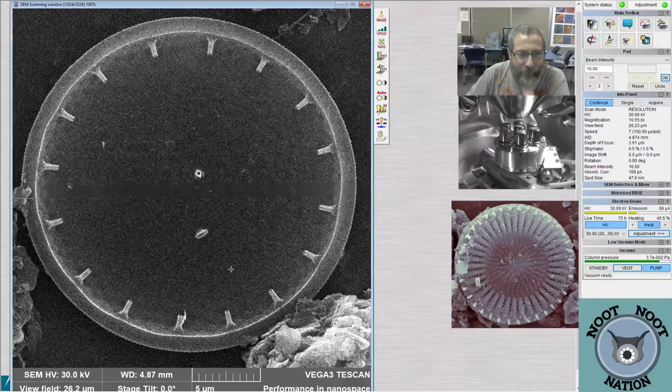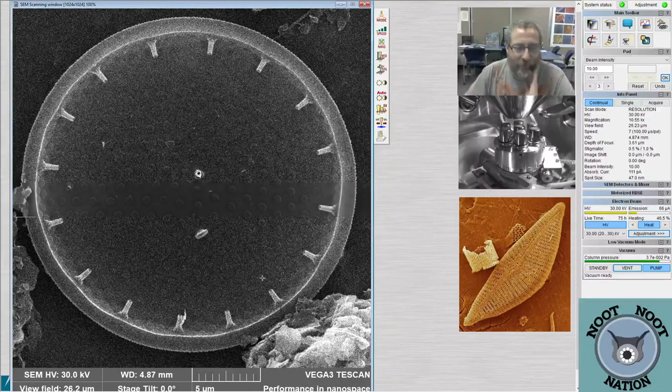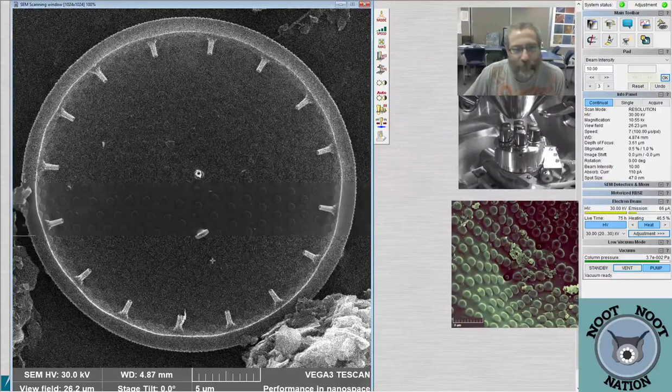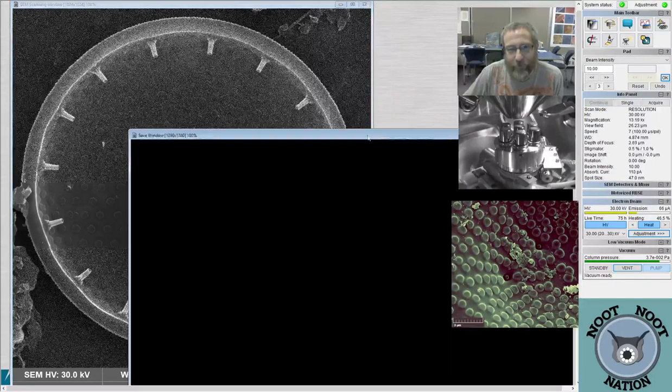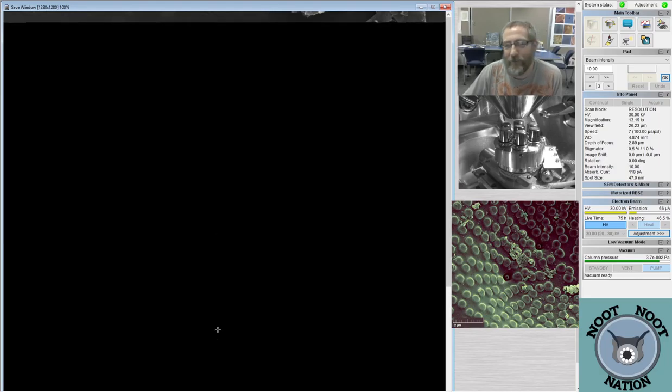But this is going to be a nice... they'll know right away probably if it's one of the freaky genera that have been separated because of these features, right? They would just know it probably. Okay, I'm going to take a picture because I don't know what it is. Always good when I don't know what it is to take a picture.